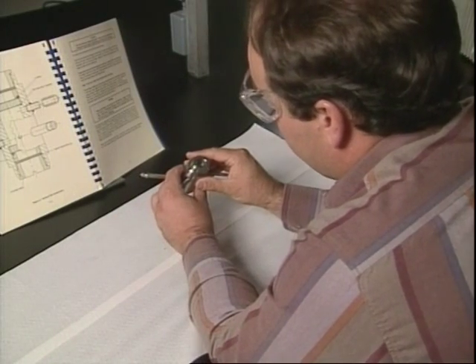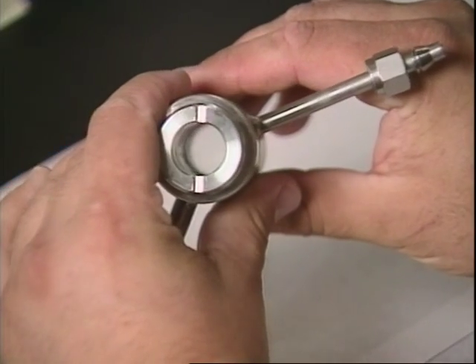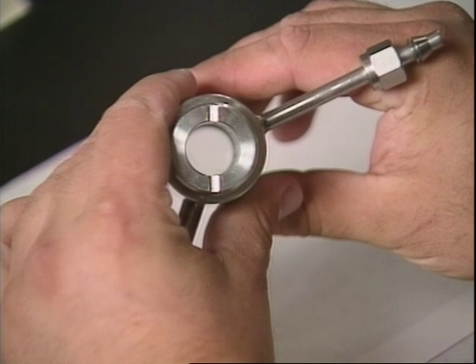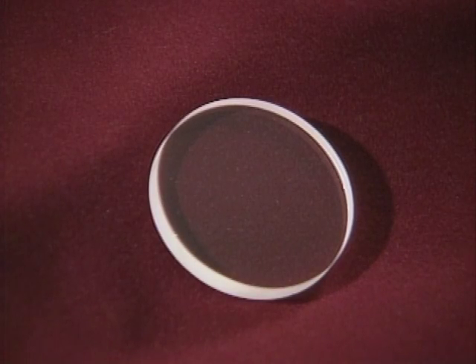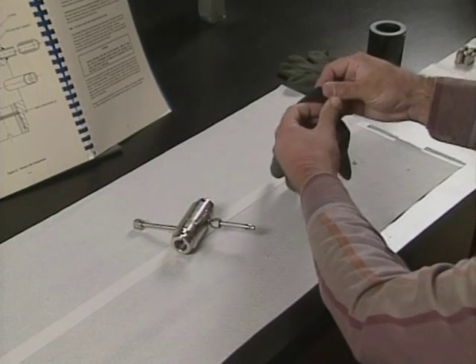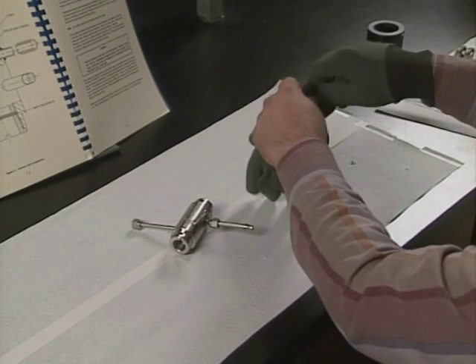Before the cell windows can be removed and cleaned, some precautions should be noted. Cell windows are often high-grade single crystal material. They may also have special coatings that make them very fragile. The window coatings for some applications may include germanium, barium fluoride, or zinc selenide, which are toxic. See the specifications for the application you're working with and handle any toxic coatings according to your facility's guidelines. Cotton gloves or finger cots should be worn when handling the cell windows.